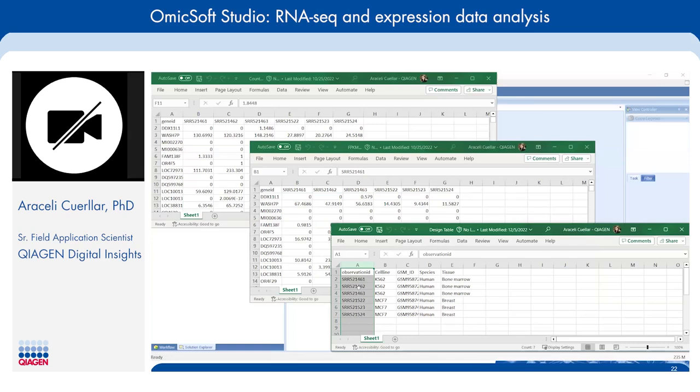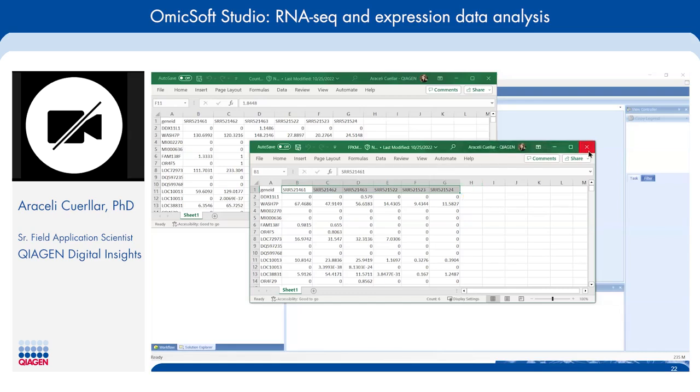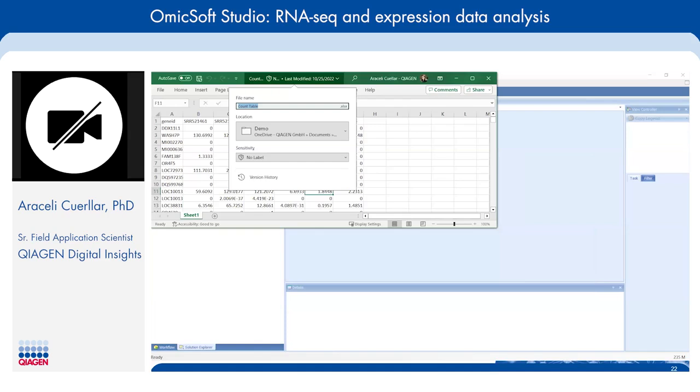So here, for example, the observations in the matrix are going to match those in the samples, right? So we do have some matching going on there. And then the subsequent columns just give you some sample level information. So here we can see what tissues the samples are coming from, what cell lines, and so forth. And so here you can see that we're working with cell lines that are originating from bone marrow and breast tissues. These are the files that we are going to be working with, and these are the ones that are provided in the slides for today.